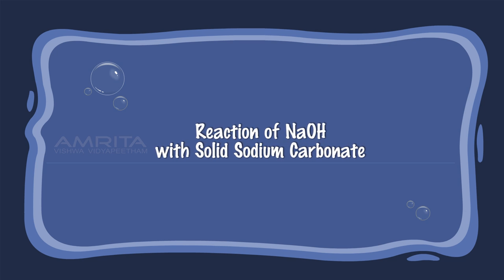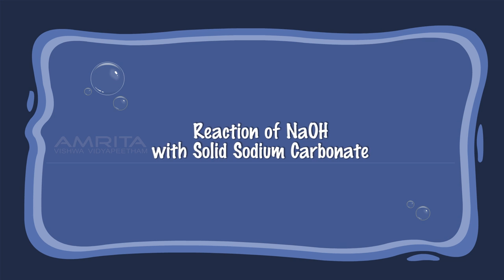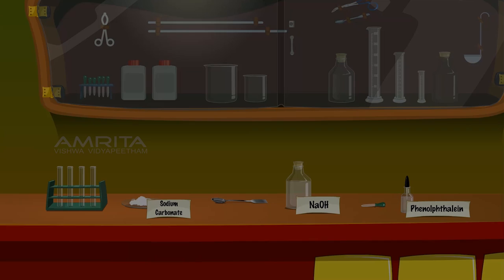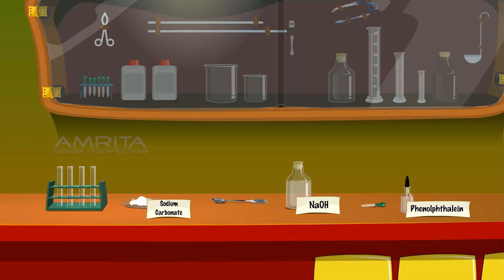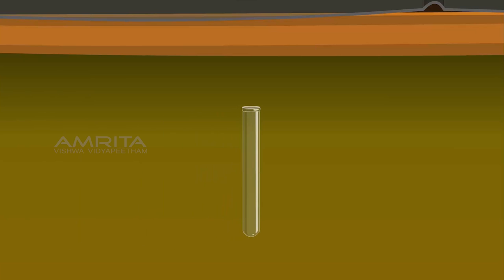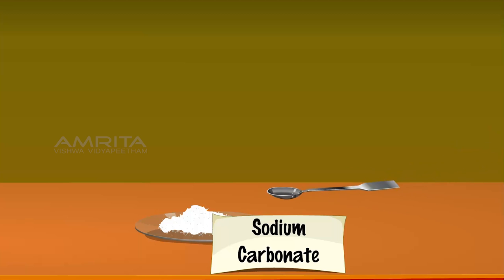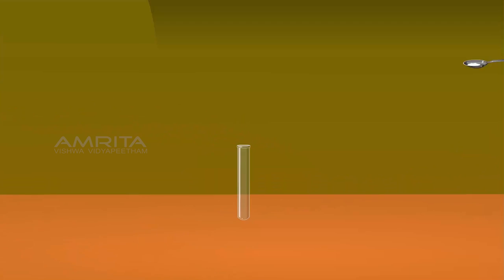Reaction of NaOH with Solid Sodium Carbonate. We require a test tube, a test tube rack, some sodium carbonate in a dish, a spatula, NaOH solution, a dropper, and phenolphthalein solution. Take the test tube and using the spatula, take some sodium carbonate from the dish and transfer the contents into the test tube.